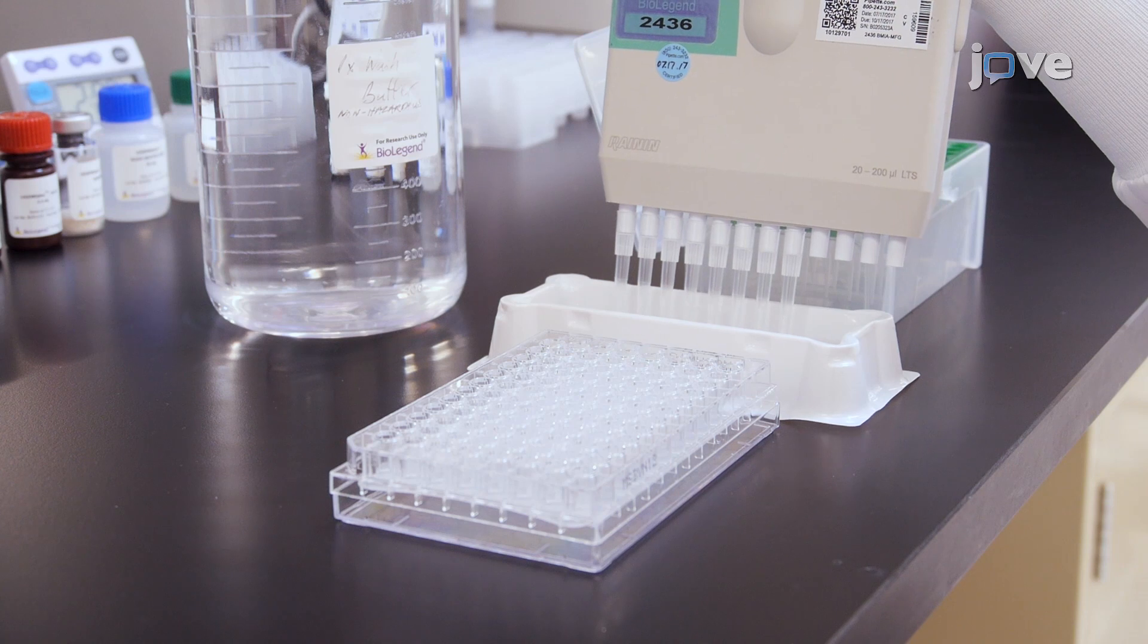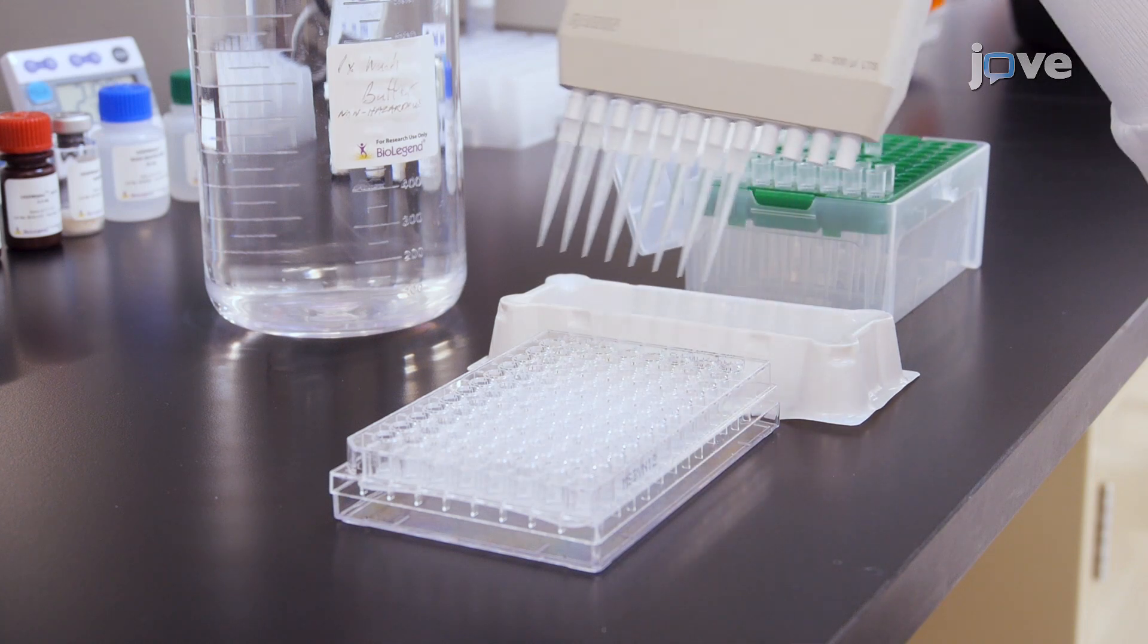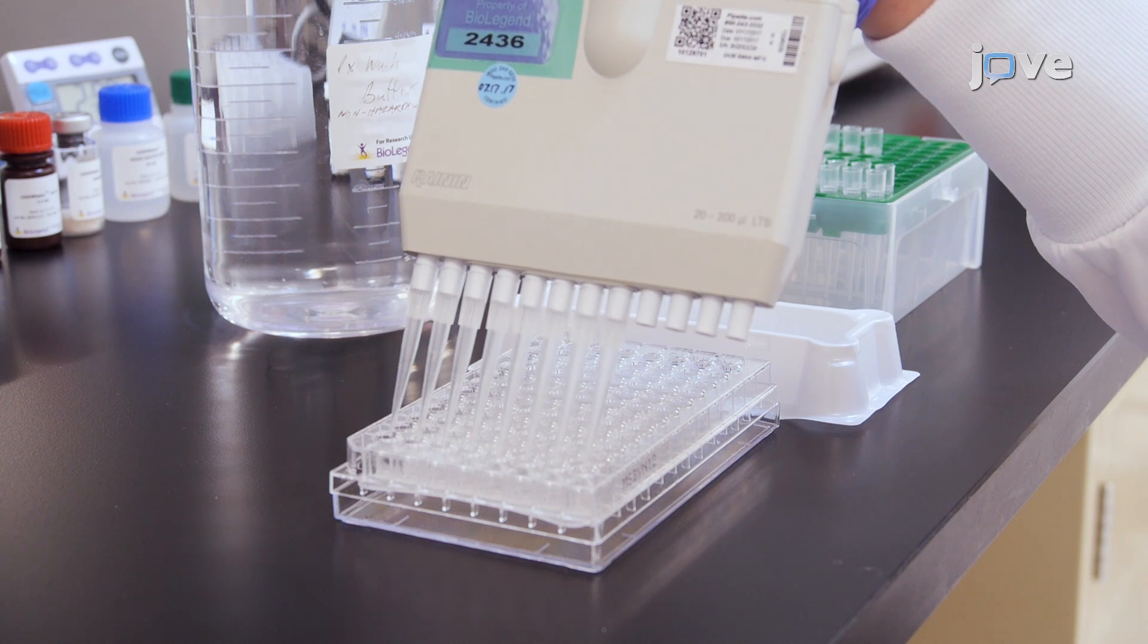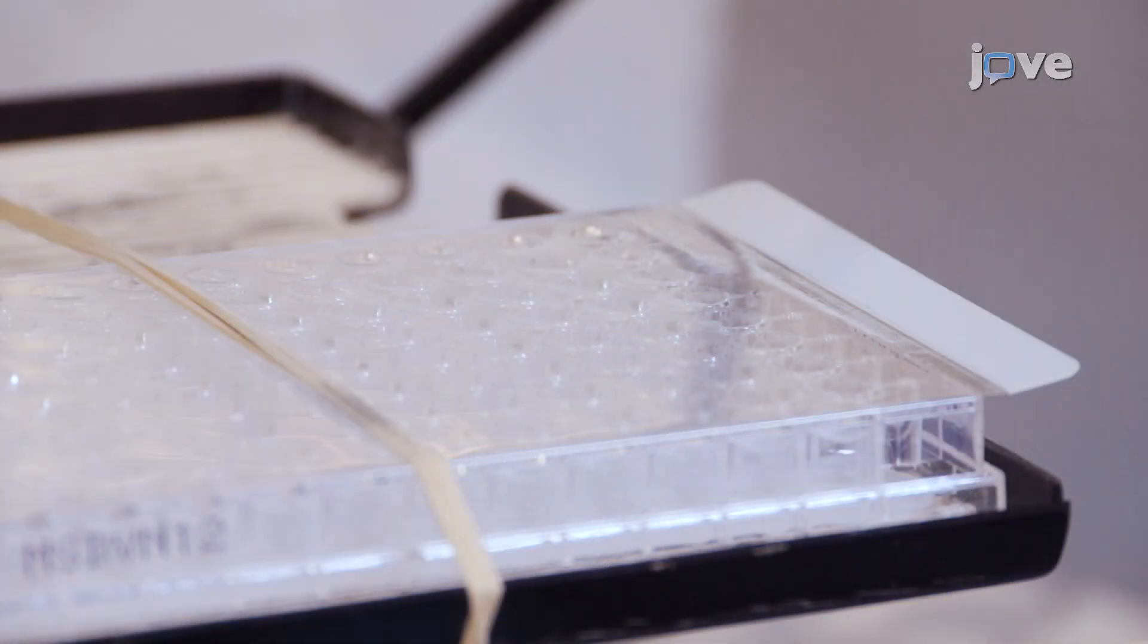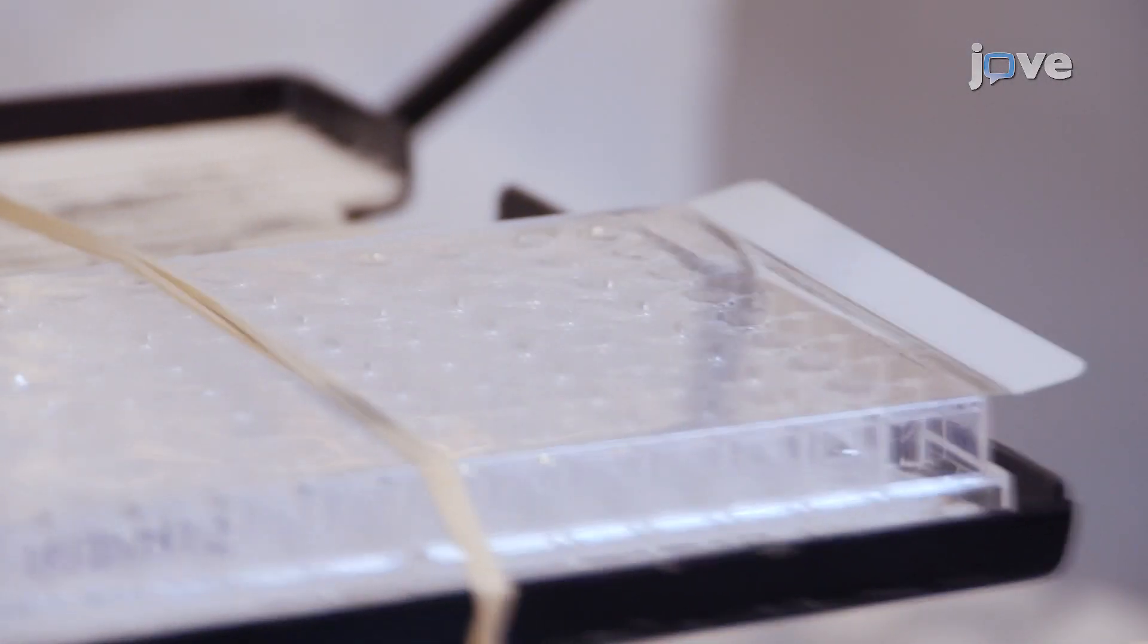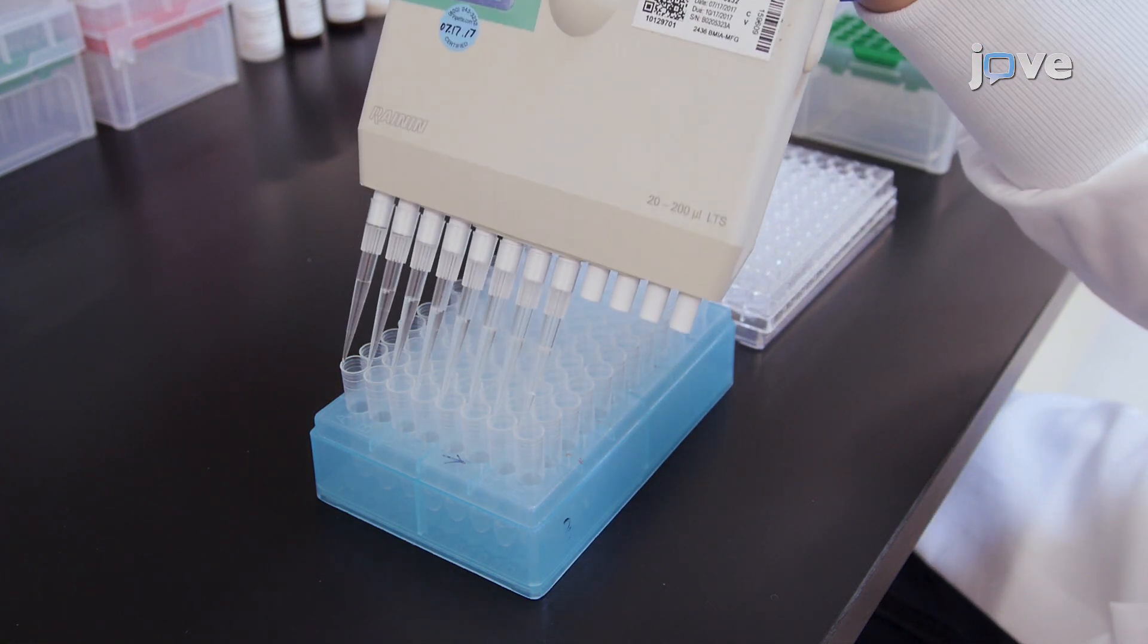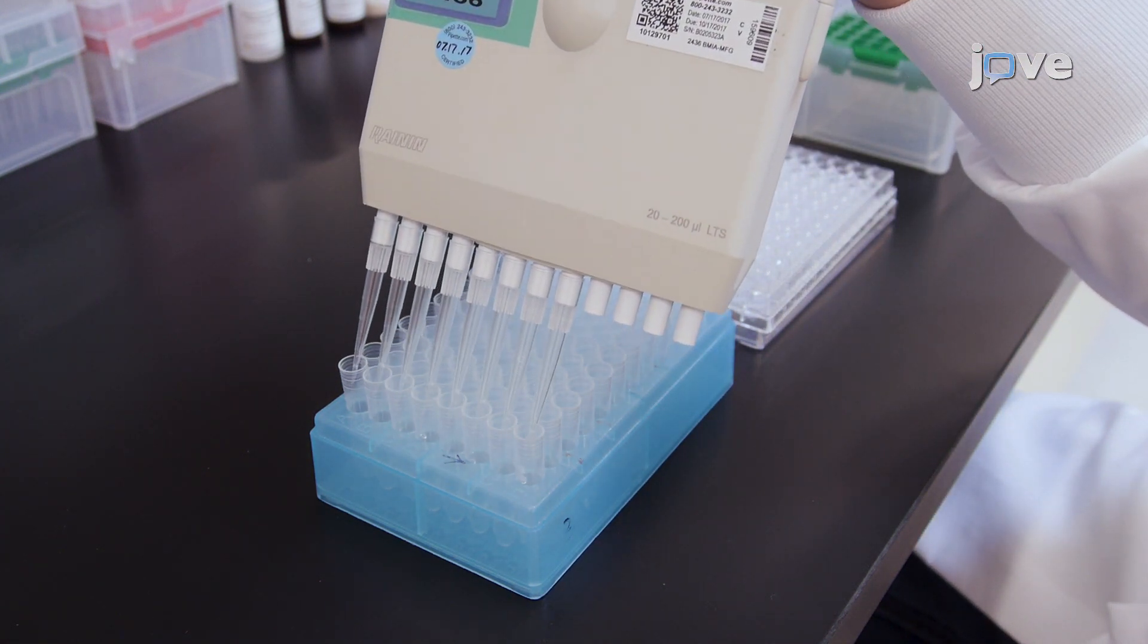After repeating the vacuum filtration step twice, add 200 microliters of 1x wash buffer to each well. Resuspend the beads on a plate shaker for 1 minute. Using a multi-channel pipette, transfer the samples from the filter plate to FACS tubes in order to read the samples on a flow cytometer.